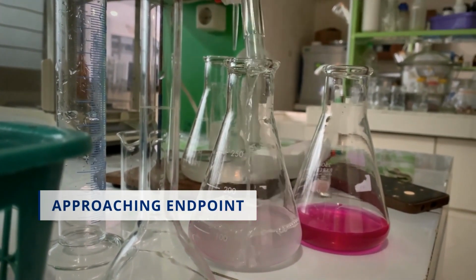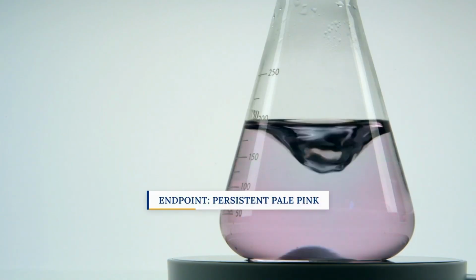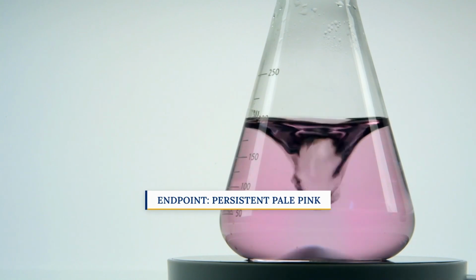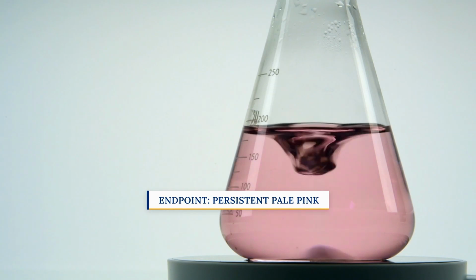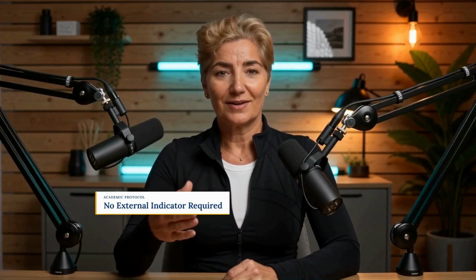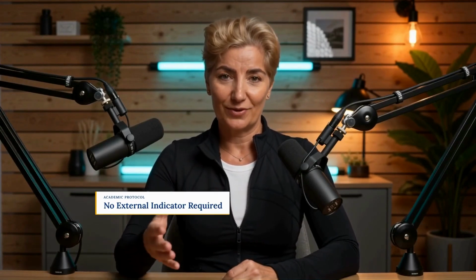The reaction slows as the reactants are depleted. The first faint pink color that remains for about 30 seconds indicates that a slight excess of permanganate is present. This marks the end point. Because permanganate changes color on its own, no additional indicator is required for this titration.